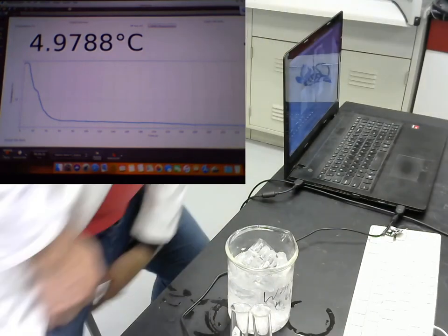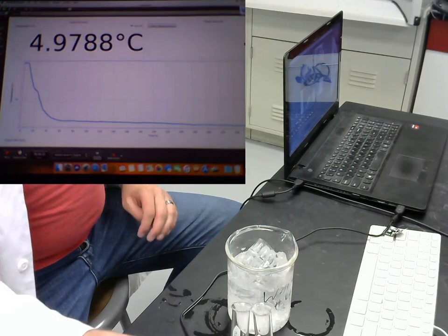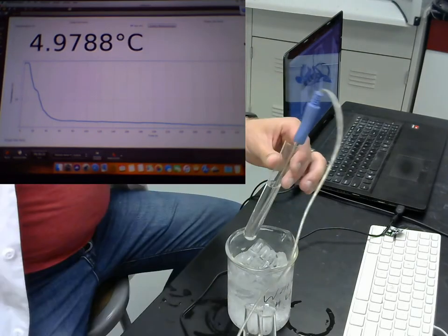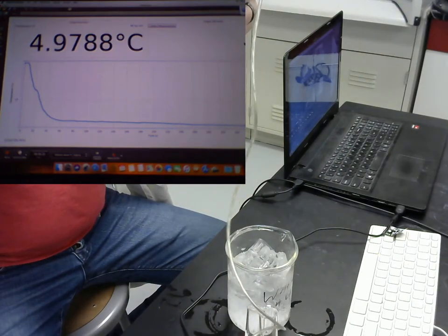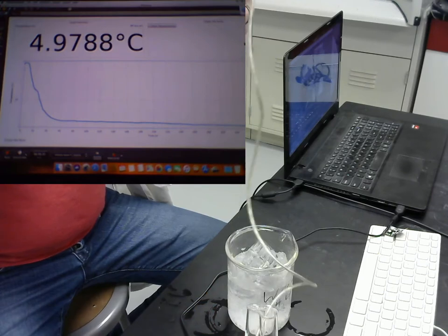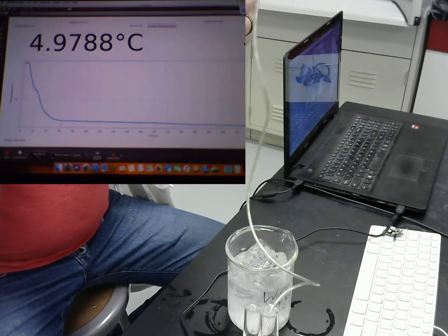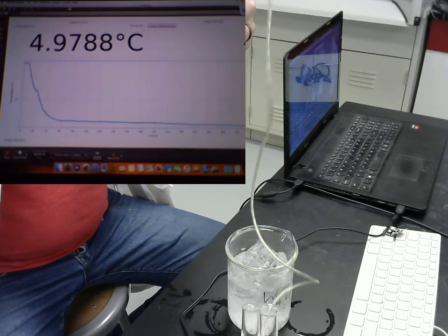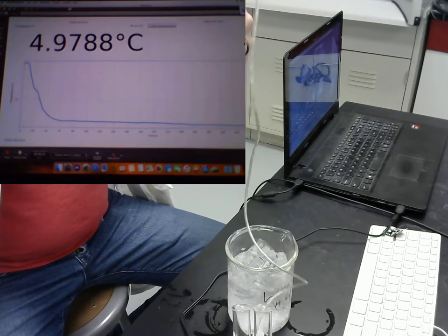Okay, so now we'll do the mixture of naphthalene together with cyclohexane. Oh, actually we better not. Looks like it hasn't quite dissolved all the way yet. That was almost a near disaster. The naphthalene is a solid, and it is soluble in cyclohexane, but I didn't do hardly anything to mix these two. I just dumped it in, and that obviously caused problems.